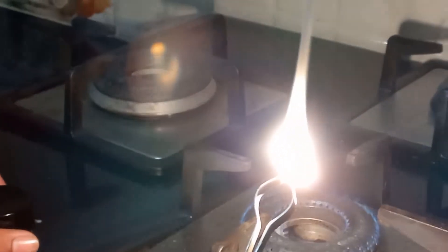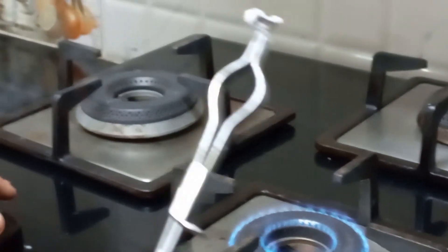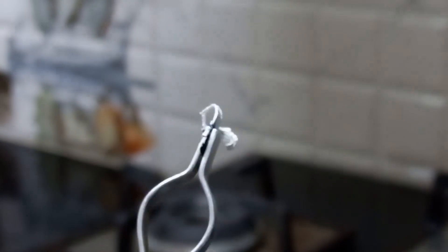You can see the magnesium ribbon burning with a white dazzling flame. So this is the remnant of the magnesium ribbon burnt. This is the magnesium oxide. You can see the magnesium ribbon reacts with the air to form magnesium oxide. Air means with the oxygen, it forms magnesium oxide.